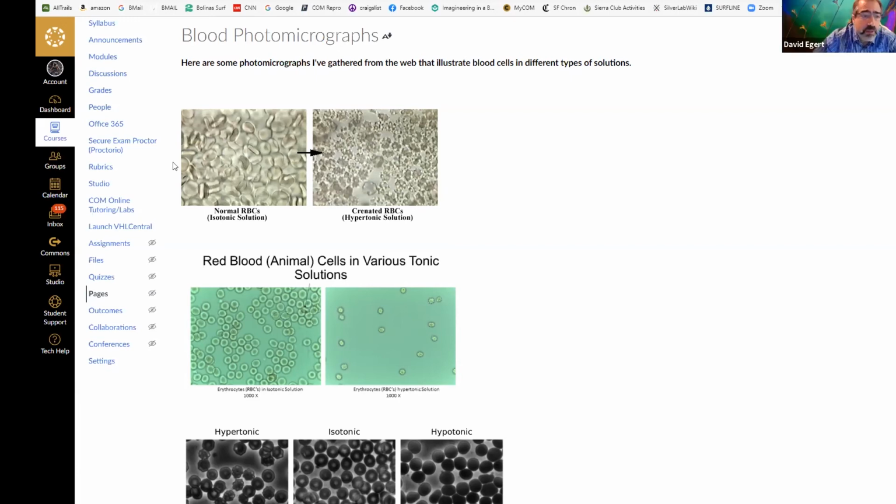So a red blood cell on its own looks kind of like a little pucker. It's round, but there's no nucleus in it. So it's kind of flat with its sides kind of sucked in. Normal red blood cells are red, but they don't look that red because there's so little hemoglobin. They're very thin and they're shined with a bunch of light. So they'll look kind of reddish, but imagine you have a very thin layer of reddish fluid: the thinner the layer is, the less you're really going to see it being super red looking.